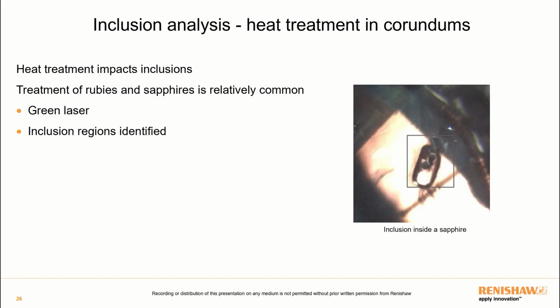And if the inclusion is not immediately beneath the surface, and this one was about 500 microns below the surface, a long working distance objective may be needed too. So here we use the ×50 with a working distance of 8.2 millimeters. And we use the green laser, and a high resolution grating, a 2400 lines per millimeter grating, that provided the resolution of one wave number.